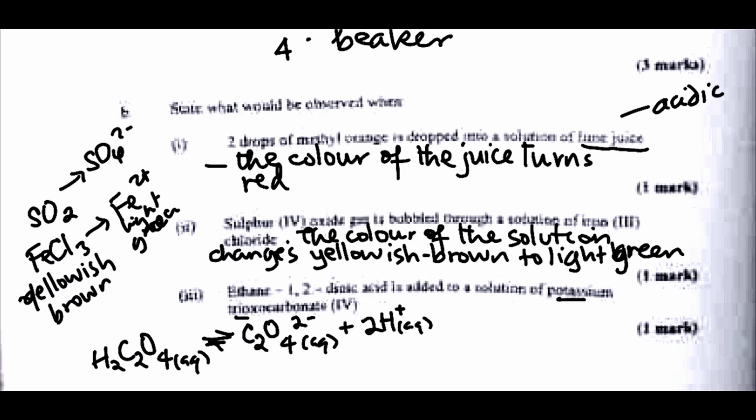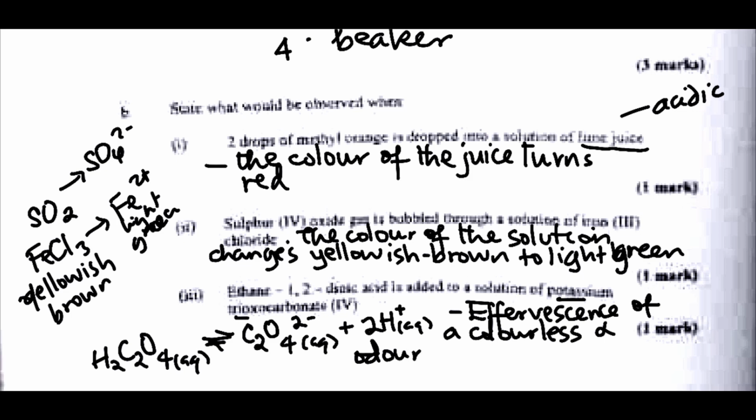Of carbon(IV) oxide. So what will we see? There will be effervescence of a colorless and odorless gas that turns lime water milky.